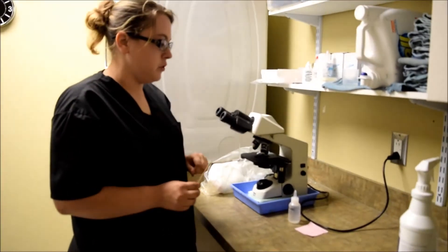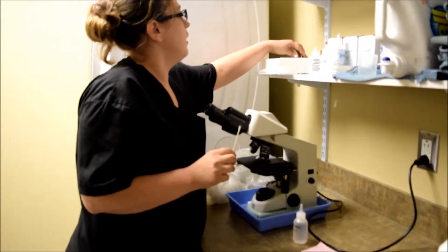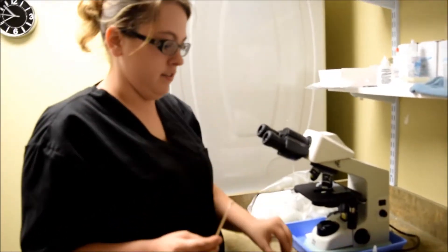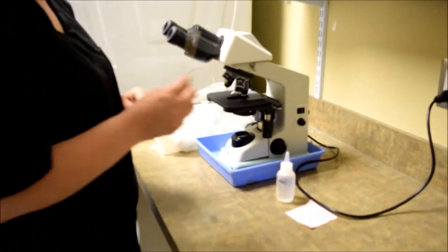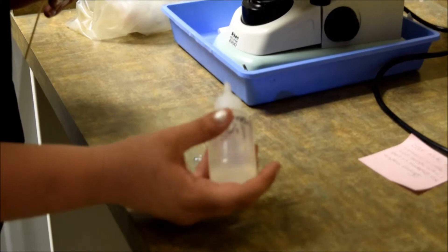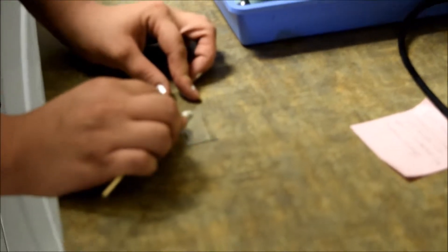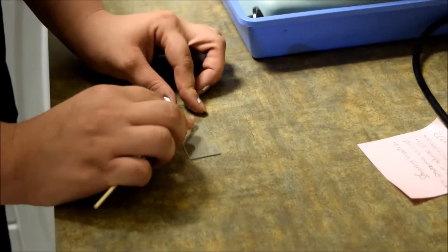My name is Anna. I'm going to do a check for ear mites on a feline. I've got my slide and I've got my sample. I'm going to put a drop of mineral oil on the slide and roll my sample around in the oil, just to try to knock off some of that stuff on there.